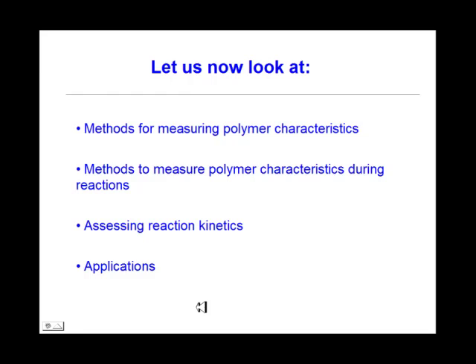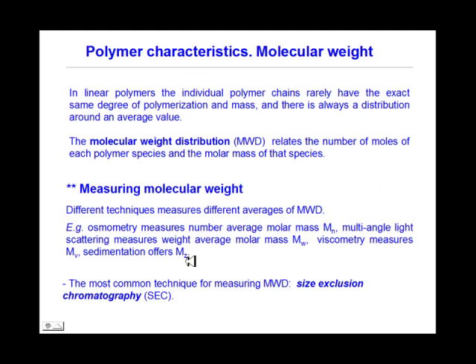Now let us look at methods for measuring polymer characteristics, methods to measure these characteristics during the reaction, reaction kinetics, and some applications. Polymer characteristics. The first one I will be talking about is molecular weight.